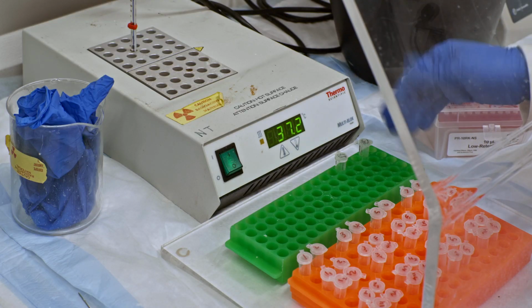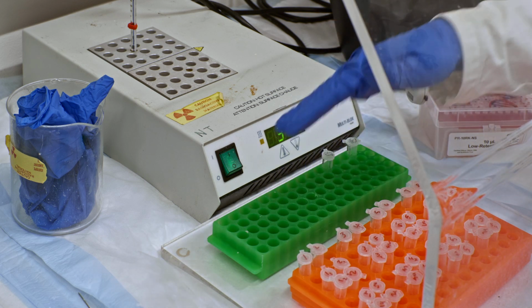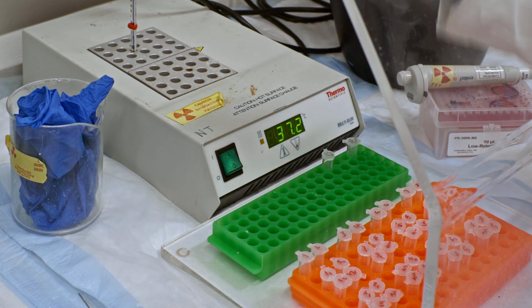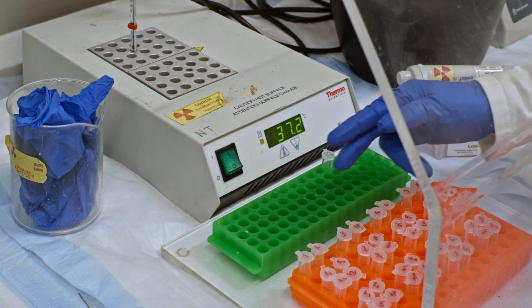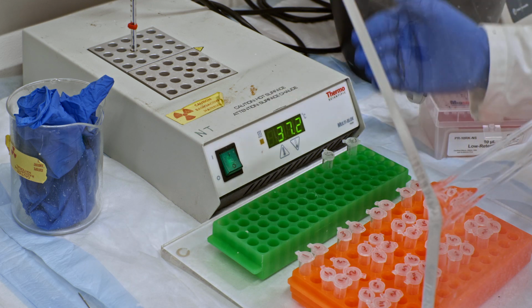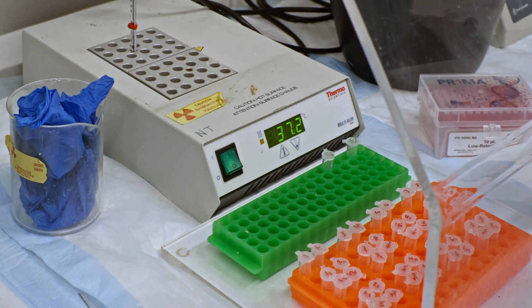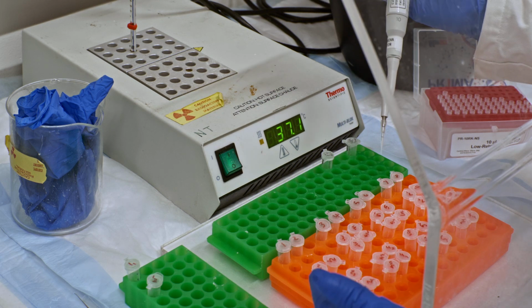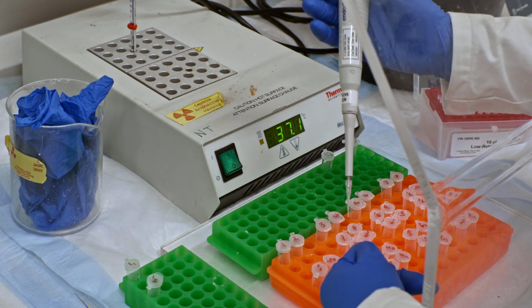So now we've added our radio-labeled DNA primer templates into each of these reaction vessels. So currently at this point, what we have here is a reaction vessel that contains polymerase and radio-labeled primer DNA duplex. So to initiate the reactions, you need to add dNTPs. A very important thing that you need to do before you do any of that, however, is to take your first time point. So when you take your 0 time point, what you'll want to do is take 4 microliters of the reaction vessel and put those 4 microliters into its respective time 0 vessel.